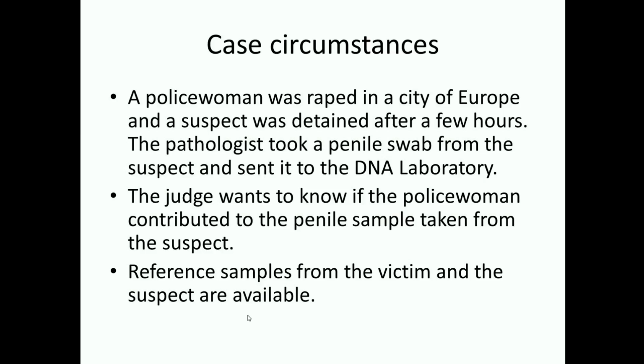A policewoman was raped in a city of Europe and a suspect was detained after a few hours. The pathologist took a penile swab from the suspect and sent it to the DNA laboratory. The judge wants to know if the policewoman contributed to the penile sample taken from the suspect, and reference samples from the victim and the suspect are available for analysis.